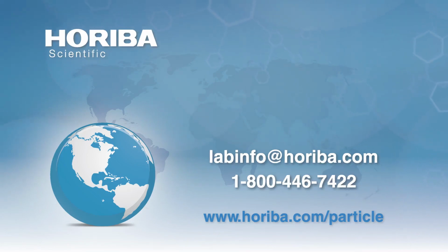It's a slightly different thing, but HIV is of course transmitted sexually, and it turns out that the pH in the vaginal lumina changes, and when it changes, the zeta potential of the HIV changes. So the fact that they're using it for COVID-19, way to go.